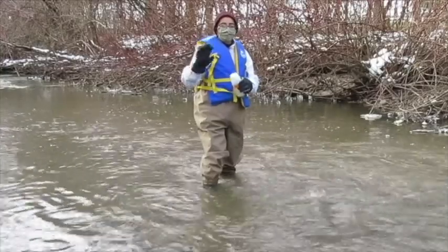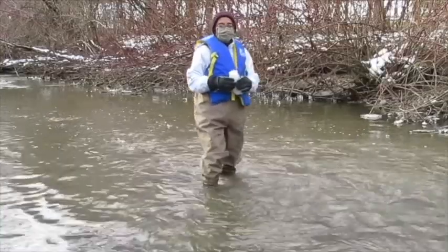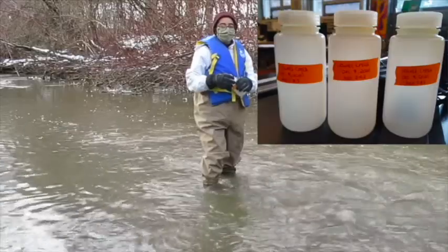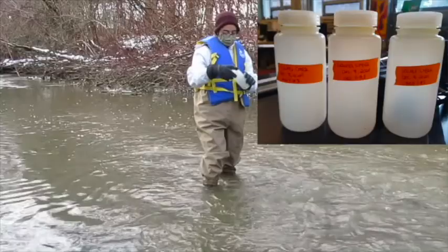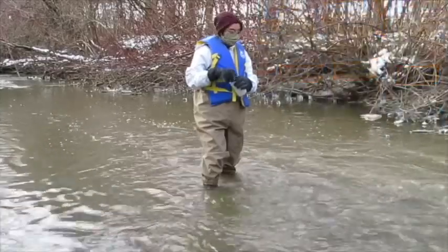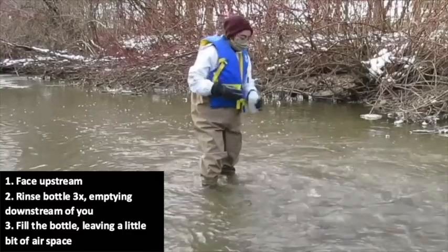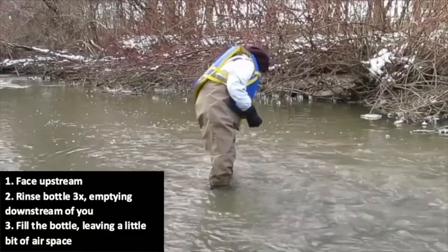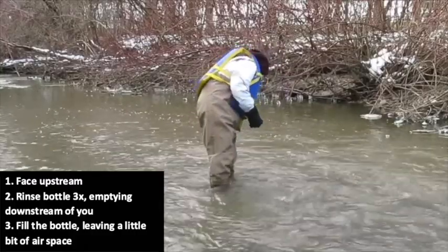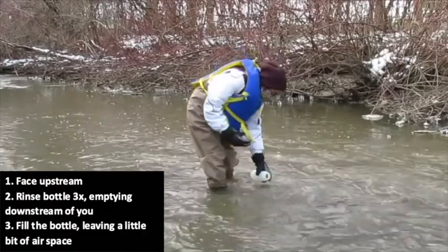Here we are in Laurel Creek, a creek that runs through UWaterloo campus. We are in the middle of the stream at our sampling location, and our first step is to collect water. It is ideal to have three water bottles for each sampling site. Make sure your bottle is labeled with the stream name, your sample number, and date. These bottles have been acid washed and are ready for sample collection. In the middle of your stream site, being careful not to disturb the substrate or kick up the sediment, you will face upstream, rinse out the bottle a few times, and dump the contents behind you. After rinsing three times, fill up your water bottle, leaving a little bit of air space.